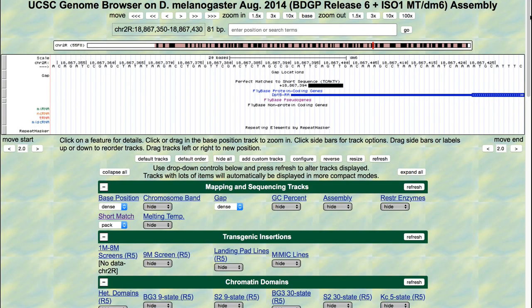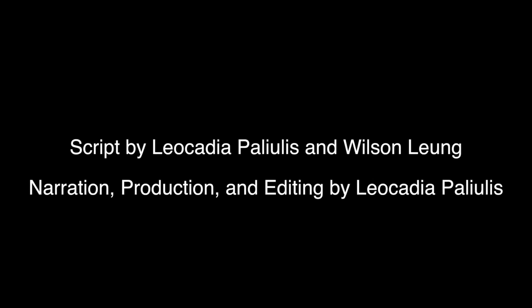You will see perfect matches to the short sequence appear as black bars within the browser window. The label next to the black bar describes the orientation and the start position of the motif match. In this case, the INR motif is located three nucleotides downstream of the annotated transcription start site of DPTB at 18,867,394 in the positive orientation.